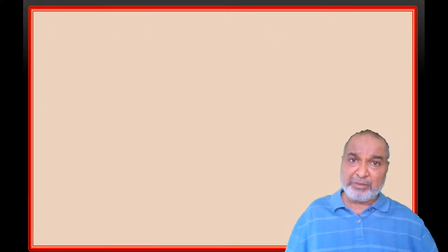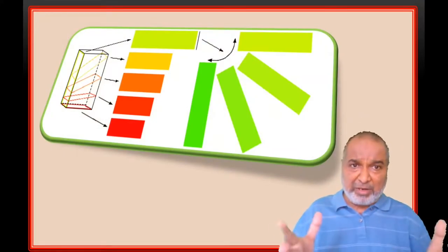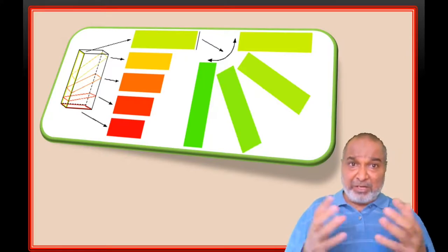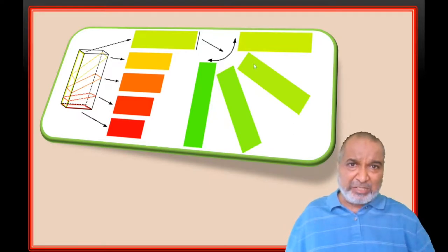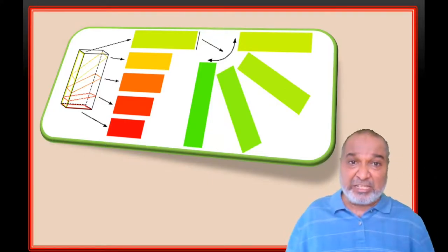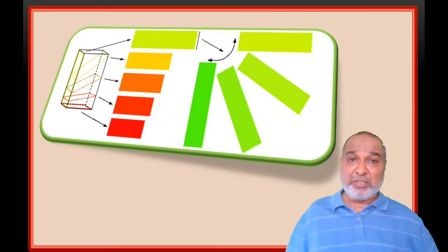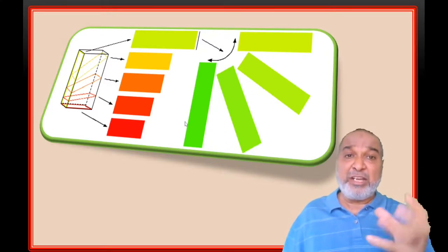It is non-pleochroic. Okay, see here, I purposely put this slide now because I don't have the microscope here, which you can easily recognize, as in the practical you have been visualizing. So here, as the stage is rotated, we find out: see, the lighter one becomes a little bit dark, a little bit dark, a little bit dark. So within this rotation, color intensity has increased within the shade of one color. So this is quantitative. Say here we have only 5% of green, 10%, 15%, 30% green. So that is quantitative pleochroism.